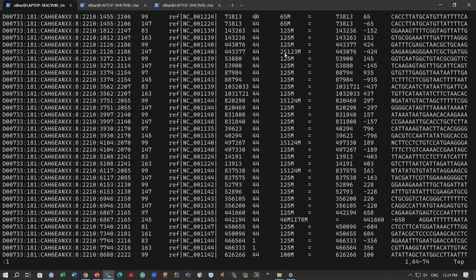Okay. So, this CIGAR string actually signifies that. Okay. So, these 2S or S will appear if you are going for local alignment. You will see a lot of these S signs, means there will be a lot of soft clipping because you are going for local alignment. Okay. So, you can continue, right, and again you can interpret this one, 1S 124M, it means we have first base soft clipped, then the next 124 bases have been aligned. Okay. So, I think this is clear now.